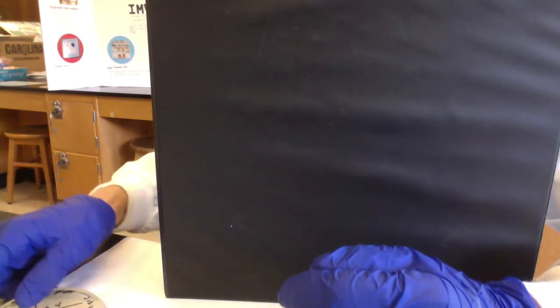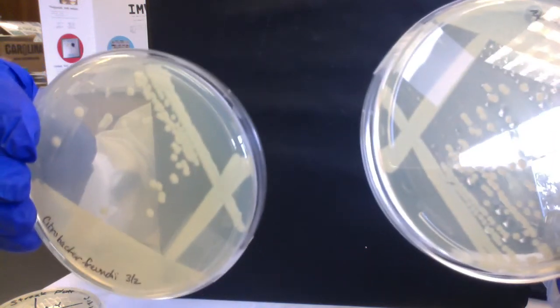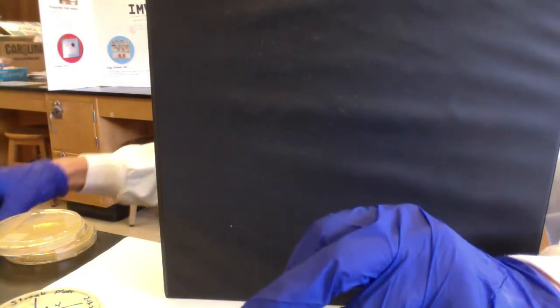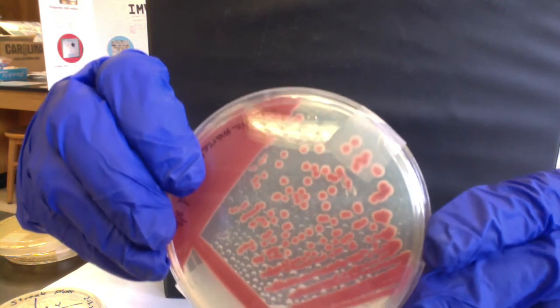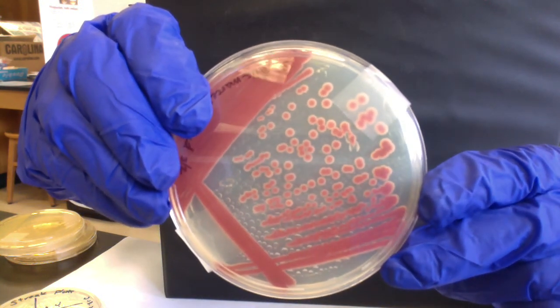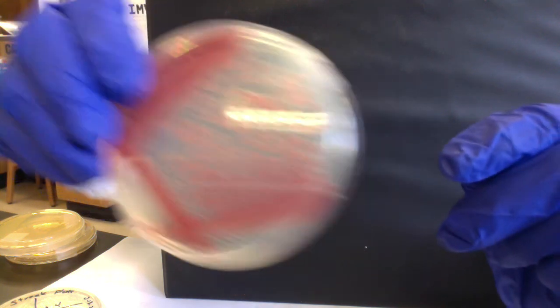I want to show you some prettier plates done by Valerie and Carmen. These are beautiful streak plates with beautiful isolated colonies. Serratia marcescens has this beautiful red pigment. Just examples of beautiful streak plates with well-isolated colonies.